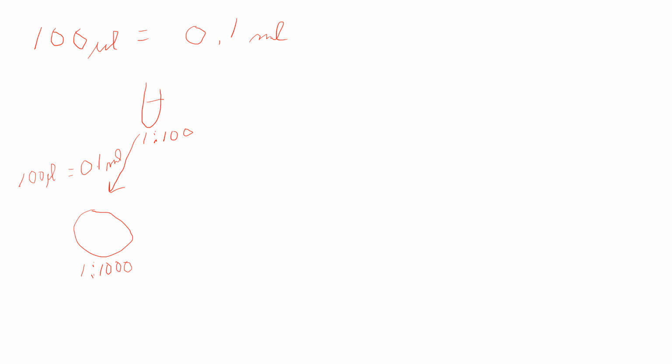With now the second page, it's showing you incubated those plates from page 1, page 2, set A, B, and C. Those are the same plates. It's after incubation, and you see all those little dots on there. Do you have to count all those dots? Yes, I'm sorry. You do. And so you count them, and then you get the average for each set.